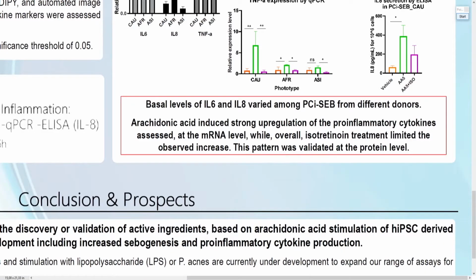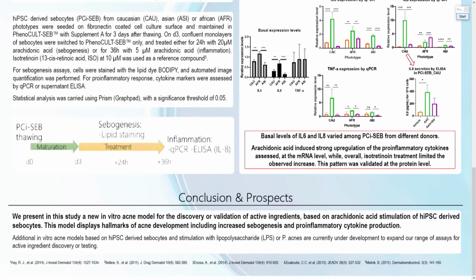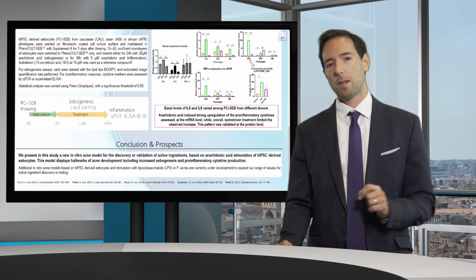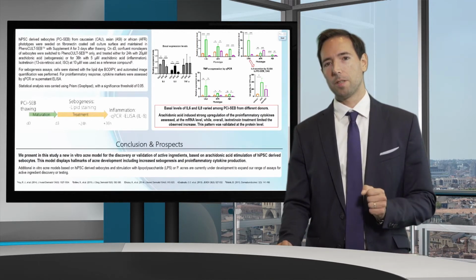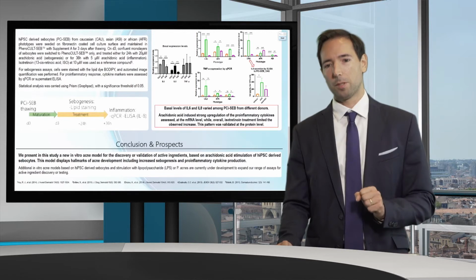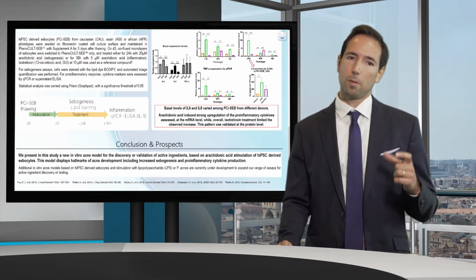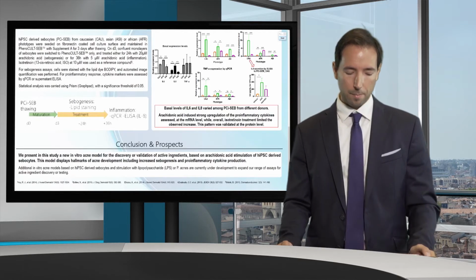So as a conclusion of this research project, we have created an in vitro model using iPS-derived sebocytes and arachidonic acid induction that in a single model shows both sebogenesis and inflammation, and consequently can reproduce those hallmarks of acne.